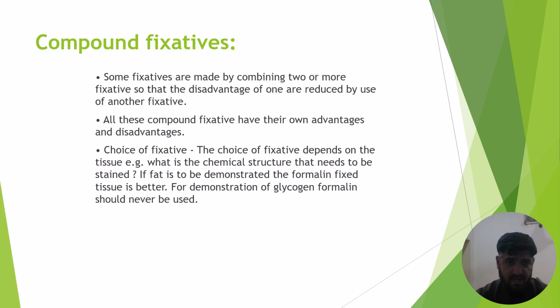Now coming to the compound fixatives, some fixatives are made by combining two or more fixatives so that the disadvantages of one are reduced by the use of another fixative. All these compound fixatives have their own advantages and disadvantages. So what should be the choice of fixative? The choice of fixative depends on the tissue.